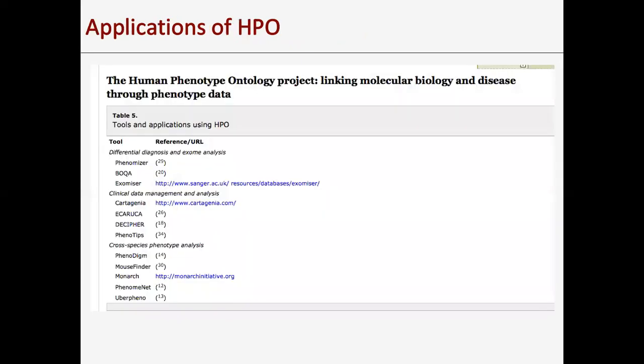So this is how it will look. This is the phenotype. We will look at this particular database in detail, because it is very important. We need to understand how one can take the genes associated with your variants or the phenotypes. There are other databases besides Phenomizer from which you can fetch this gene association. Even through NCBI, you can take that list.